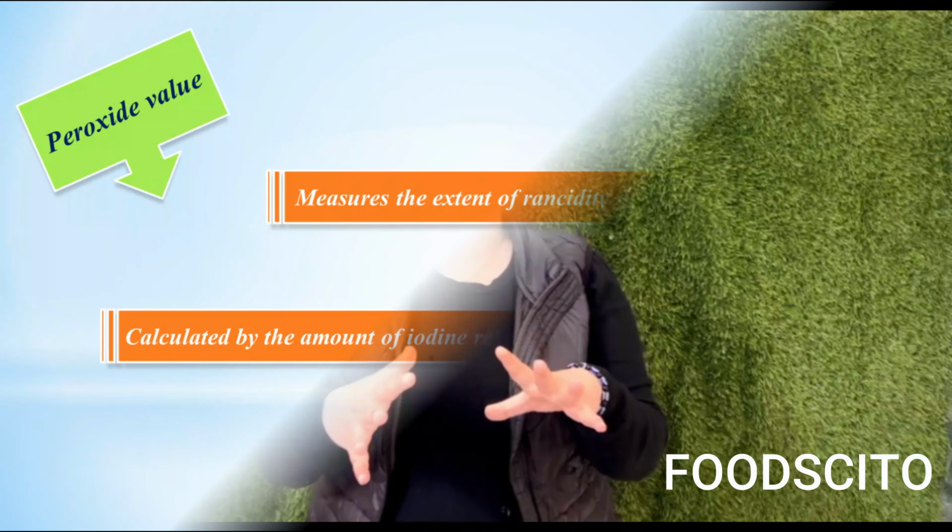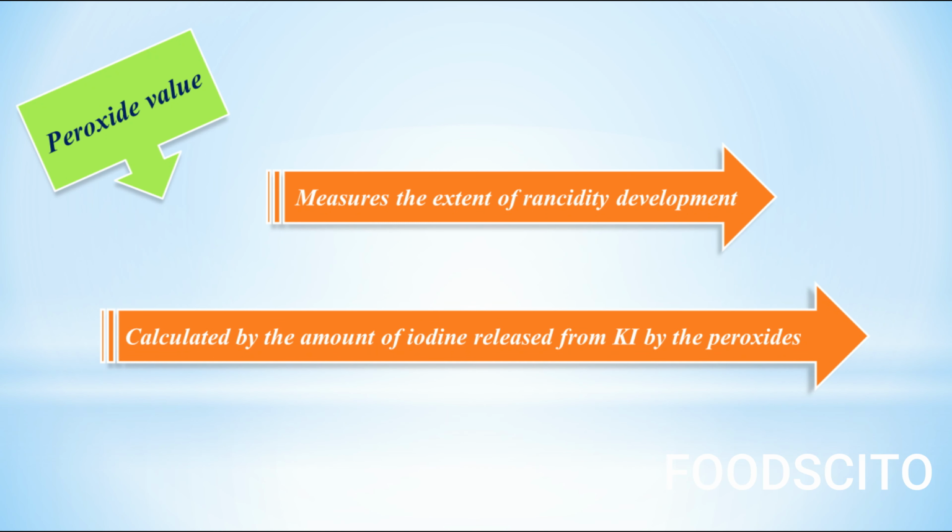So the extent of rancidity in our product can be measured by estimating its peroxide value and acid value. Now let's understand these terminologies. Peroxide value, as I have already said, measures the extent of rancidity development in your product. Now what's the next? How?